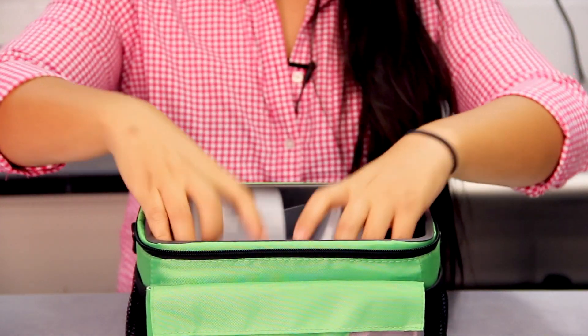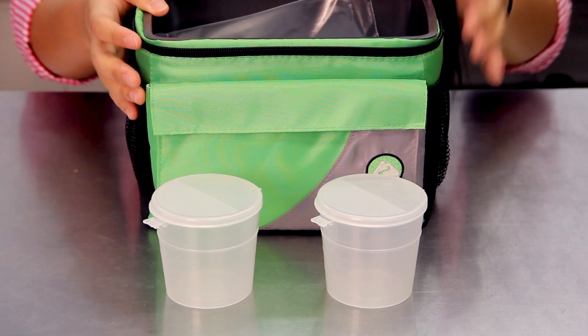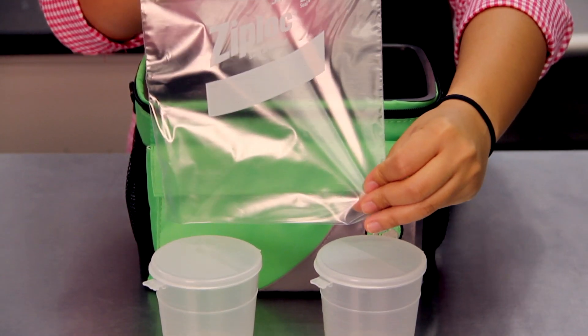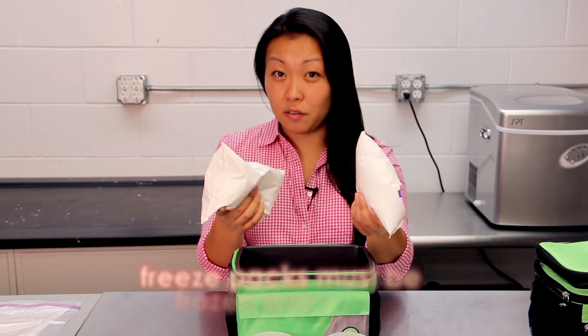You will also receive two specimen cups for your ice and a Ziploc bag. You will also receive two freezy packs. You will need to freeze these overnight.